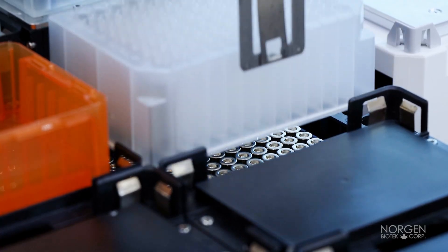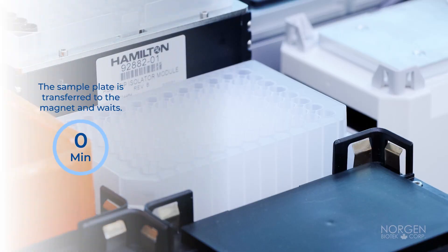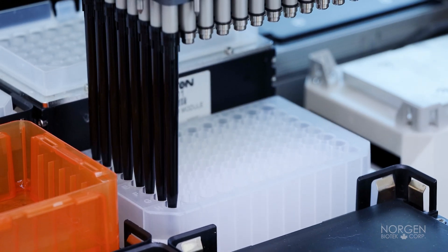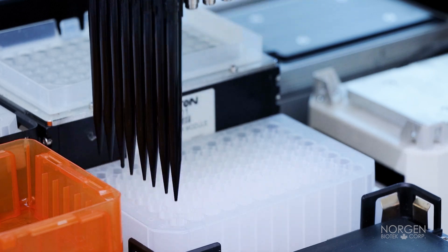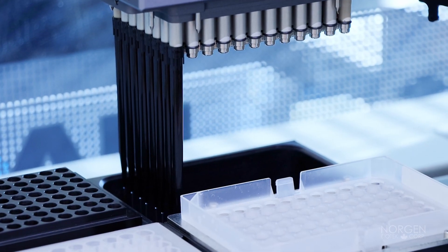The sample plate is transferred to the magnet and waits for 2 minutes for the magnetic beads to form a pellet. The supernatant is removed from the sample plate without disturbing the magnetic bead pellet, and deposited into the gravity waste.